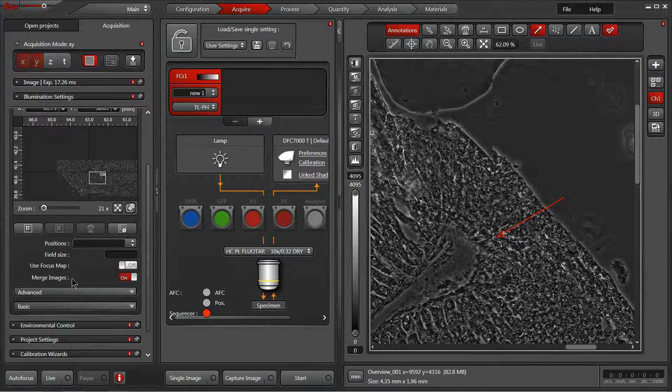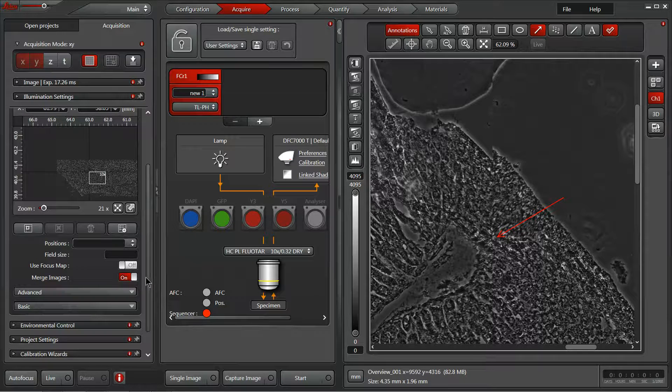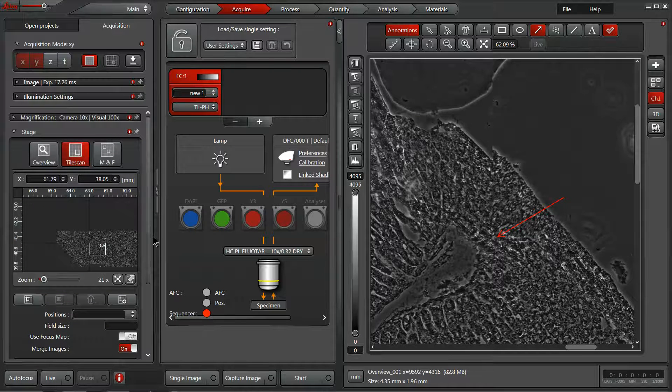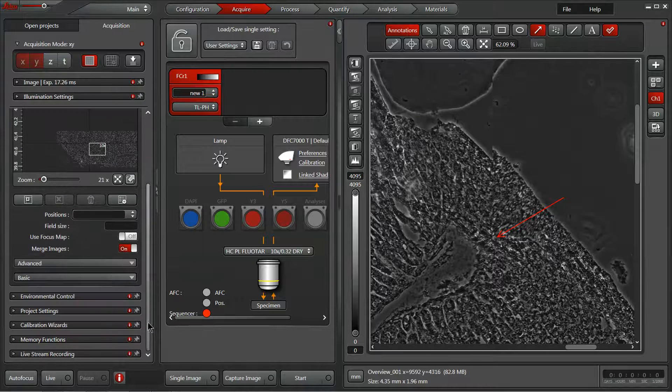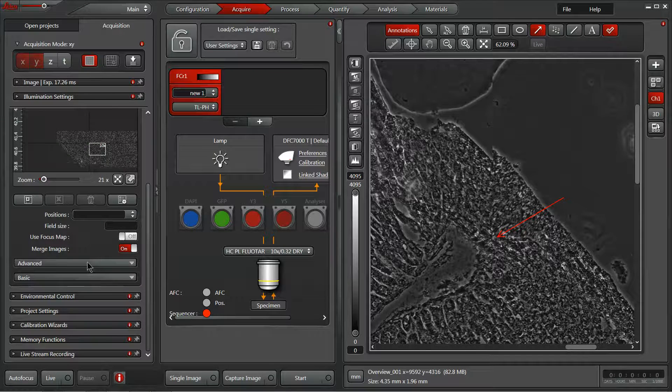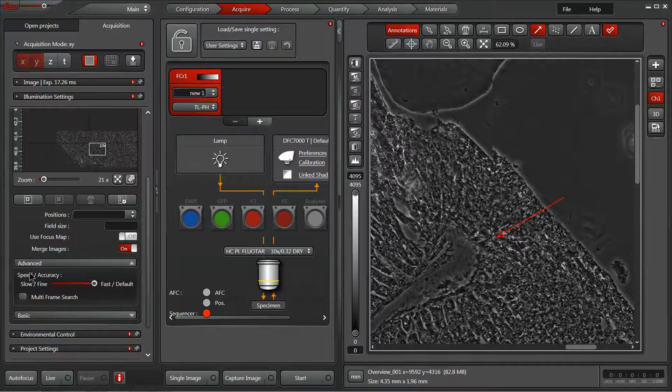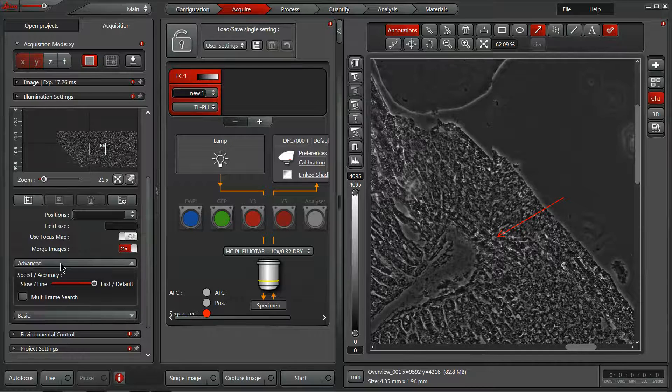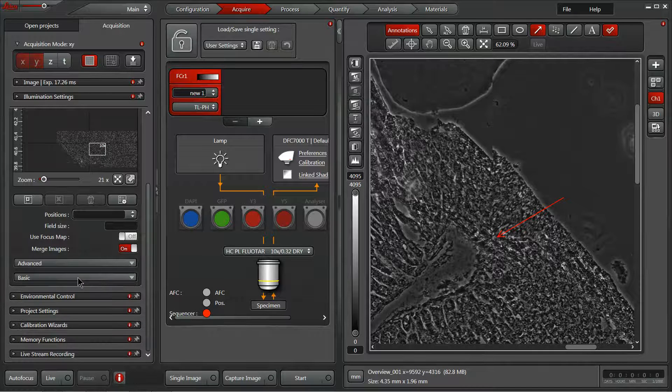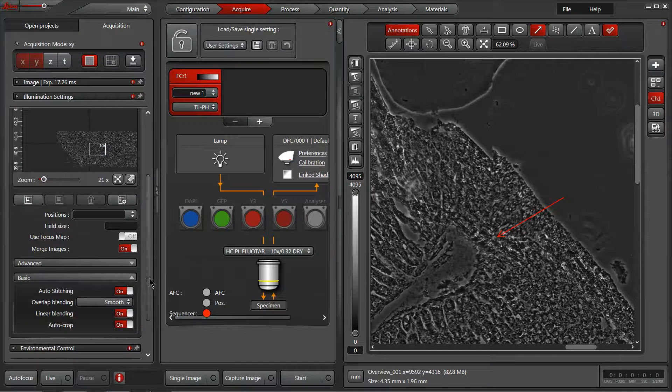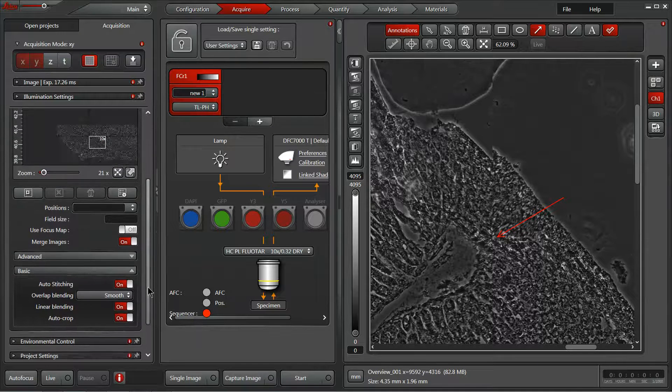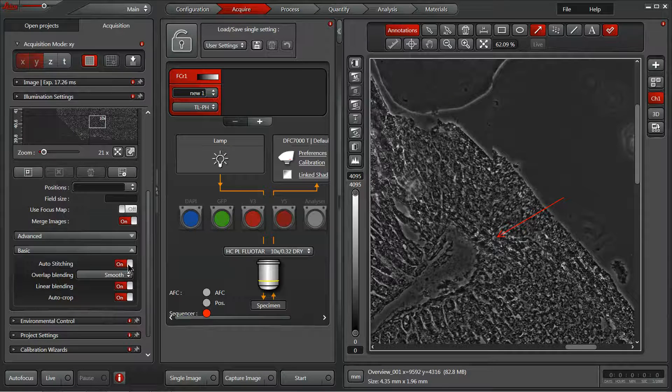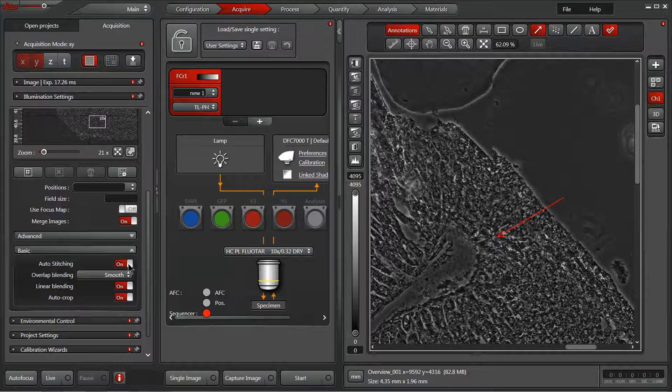If we activate merge images here in our tile scan dialog, we can go in and control the speed and precision of our acquisition and merger. Then within our basic settings, we can turn auto stitching on, which I strongly recommend if you're going to be stitching these together in the end.